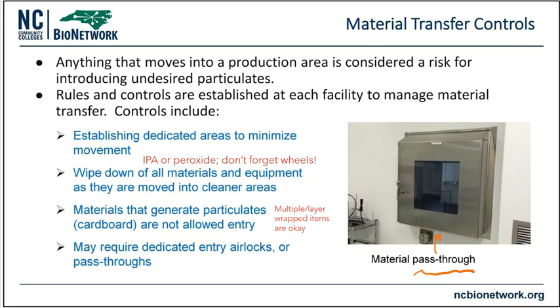All right. Now, when I say wipe down, very often we're using isopropyl alcohol. That is the abbreviation for IPA. Isopropyl alcohol. So isopropyl and then the word alcohol. This is known to you as rubbing alcohol.